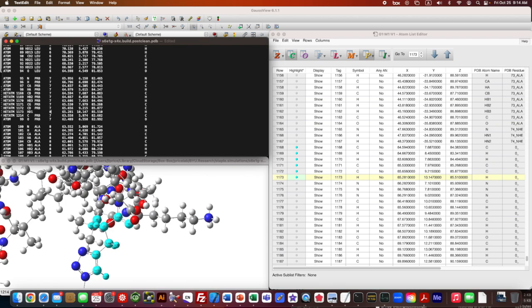So, I assume this is the same every time you do it, because it's the same staple. Yep, every time you do this, it's going to follow this pattern. If you change the staple, it would be different. There, now that that residue is done, I can delete the spaces.